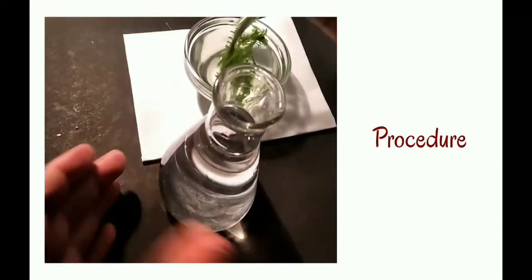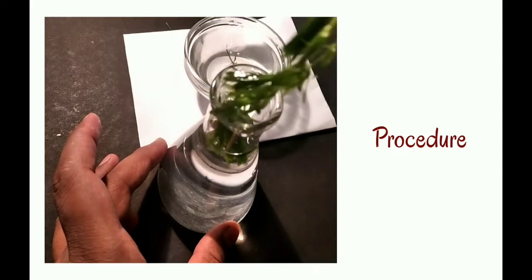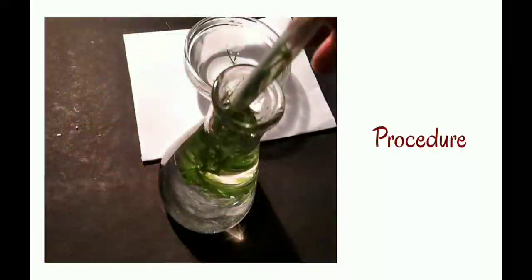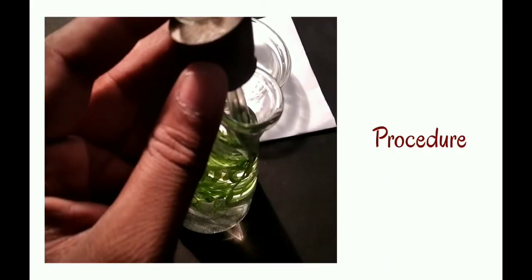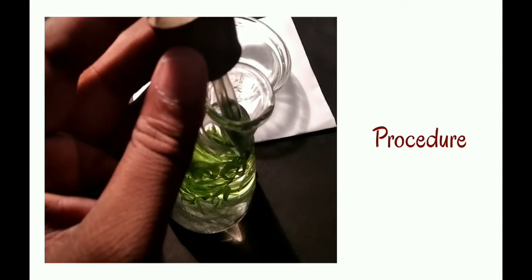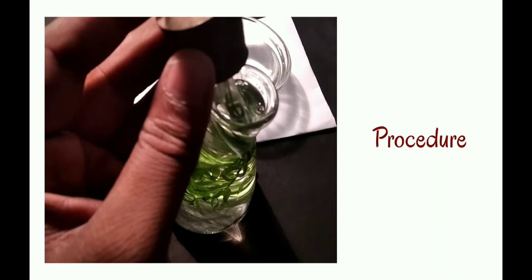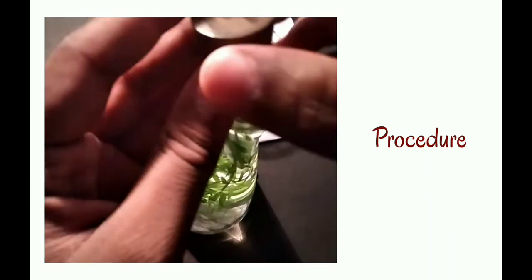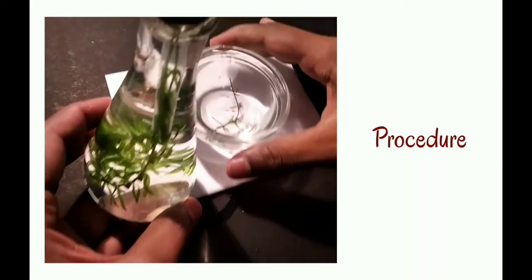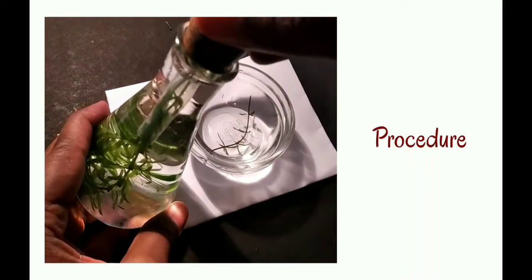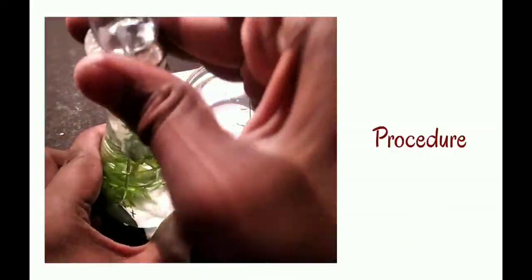Take the conical flask with water and 1% sodium bicarbonate solution which serves as the carbon source for photosynthesis. Add still more water and avoid the formation of air bubbles inside the conical flask, and add water to the water reservoir tube also.